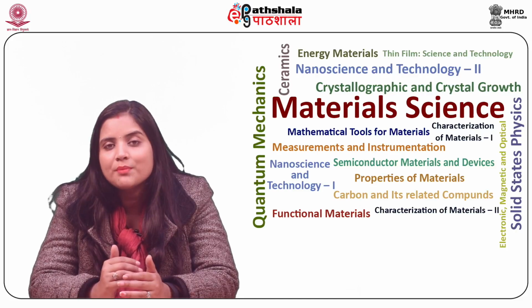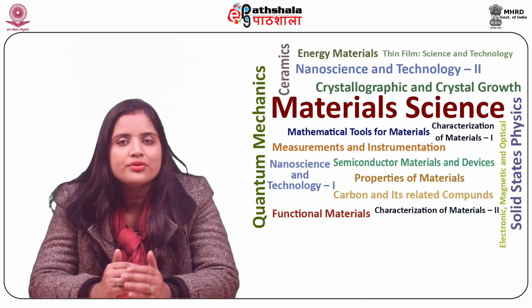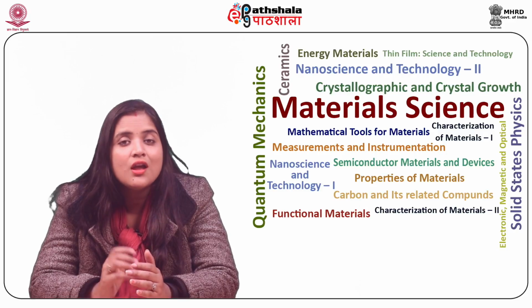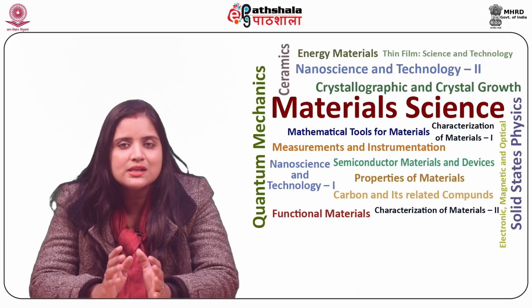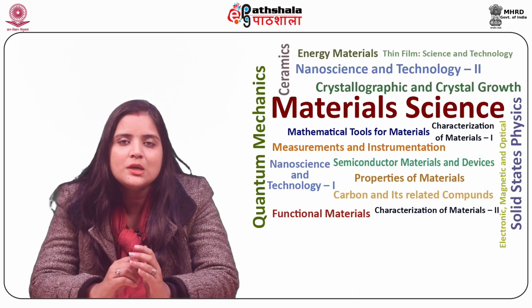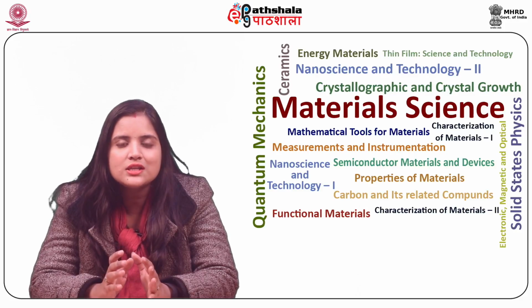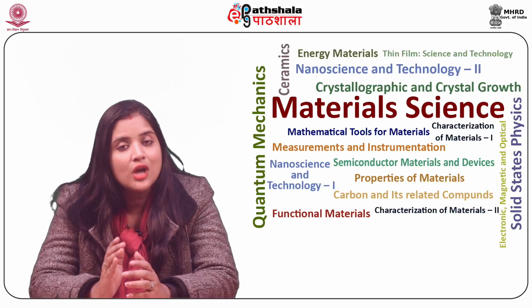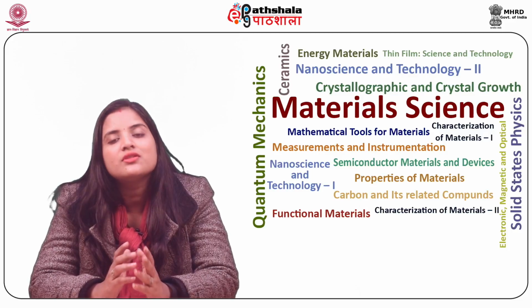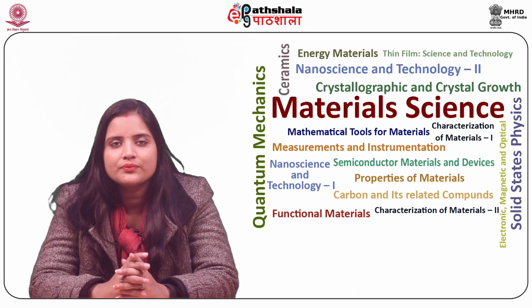This focusing geometry is called the Johann type. This organization keeps the incident X-ray angle constant along the line demarcated by the intersection of the plane of the Rowland circle and the crystal surface.